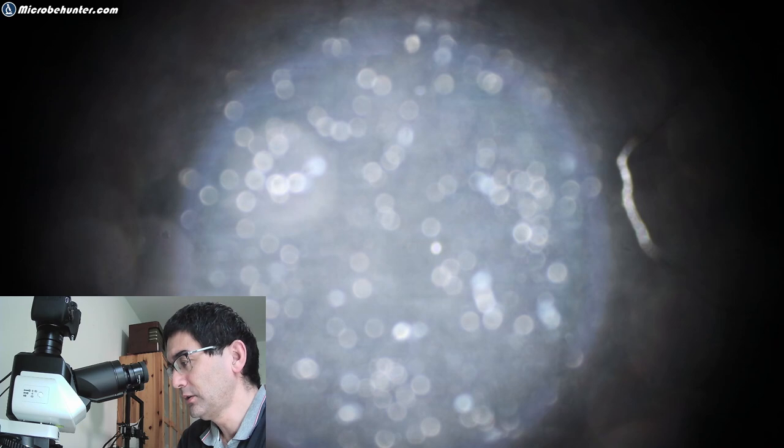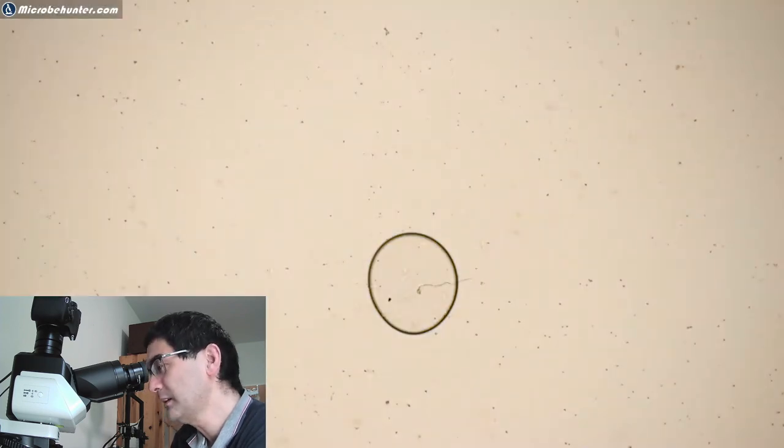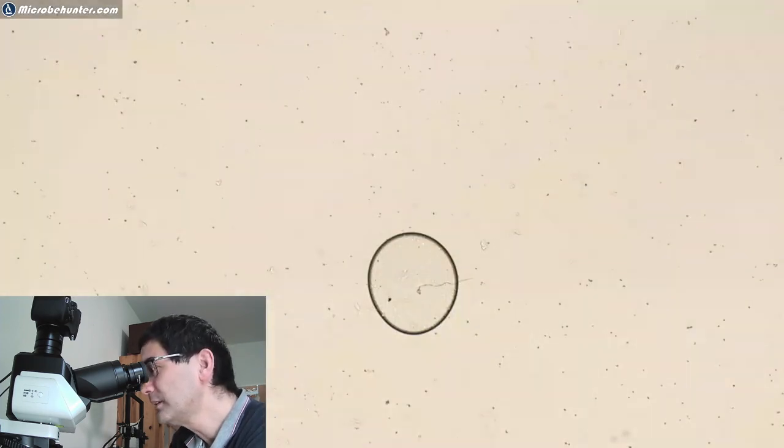Okay, so let's start off with bright field. I need to flip this out. See, I need to get the light adjusted properly. I got the wrong filter in here. I gotta rotate over. It's too bright. I cannot see anything. The air bubble might help me to focus it. You don't even see the air bubble because it's still too bright. Here it is. Okay. Yeah.